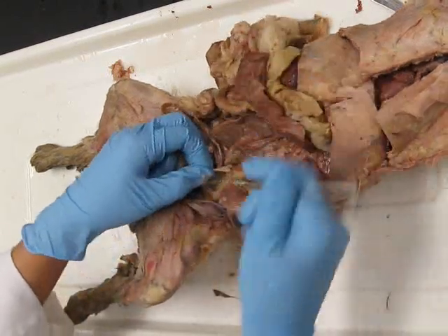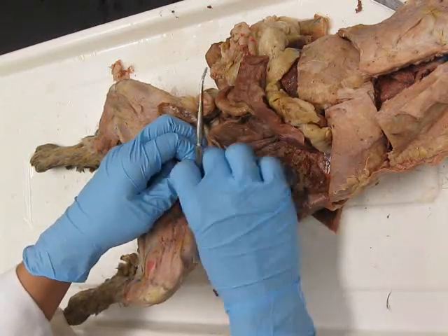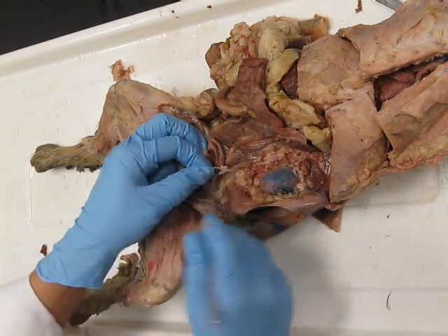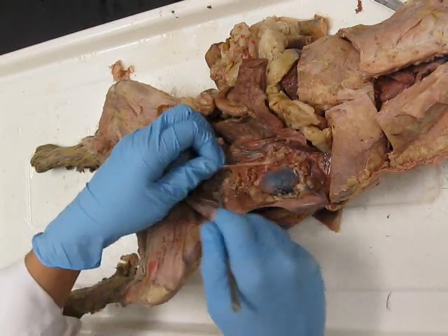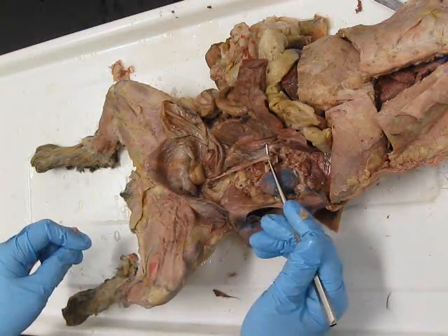And I'm just using my probe to clean along that tube, like this, it's a little fat, okay. Go on the other side of those vessels, just loop-de-doo, like this. You just slide that up there, and there's your nice ureter. And you're going to do that on the other side as well.